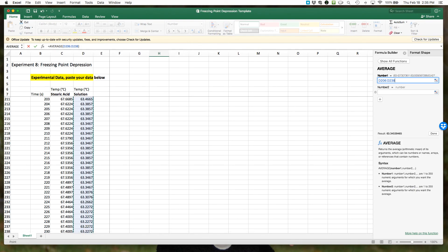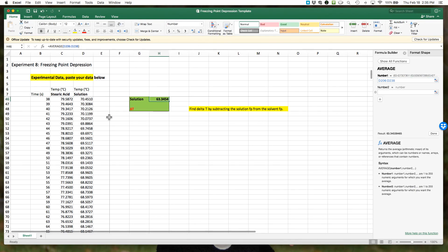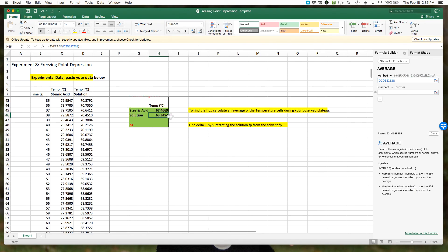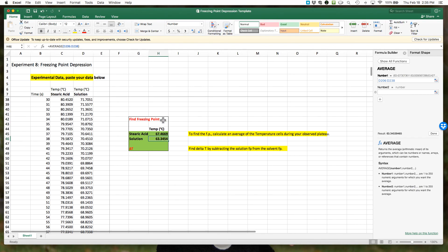We can now make a quick solution to find the delta t. We're going to hit equals.